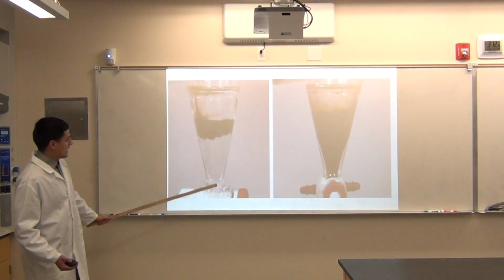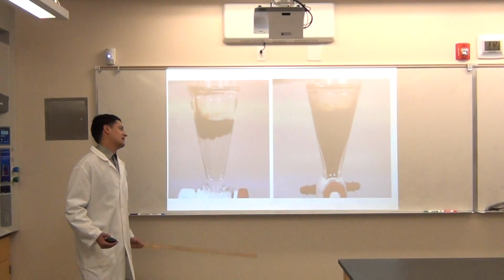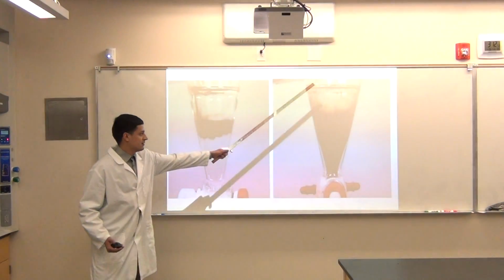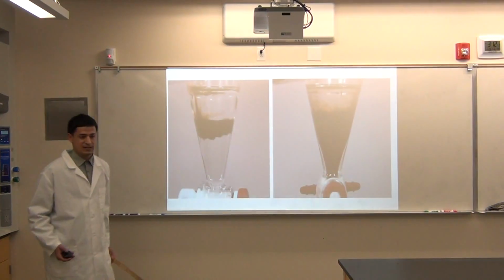So I put them all in a separatory funnel. I shook it gently, and it wasn't viable. This is all PEG, and that's all the caffeine and a bunch of other gunk. Really not ideal for purifying.